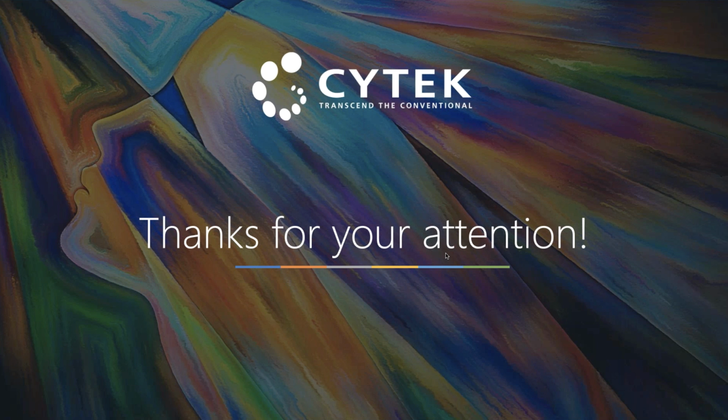There was another part for the mutually exclusive. So, about panel design strategies. Again, if you are going to use them, mutually exclusive populations will be the way to go. If it's not possible, have I used these combinations that are very overlapping in markers that are co-expressed? Yes, I have. I have used APC and Alexa 647 in markers that are co-expressed in the same population.